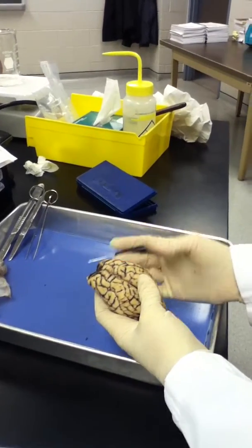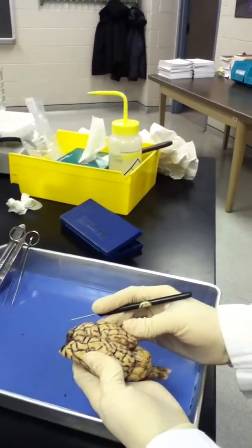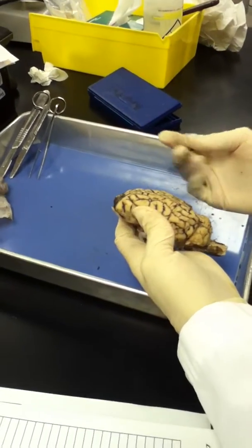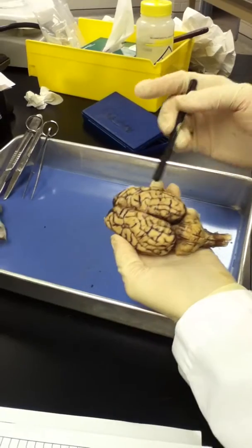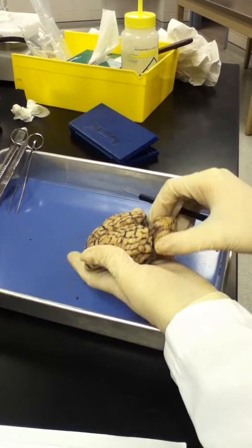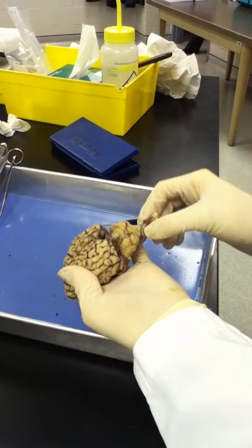This is a dissection of the sheep brain. Here both hemispheres are attached. This is the cerebrum — the large two hemispheres you see here. This is the cerebellum, and this is the brain stem.